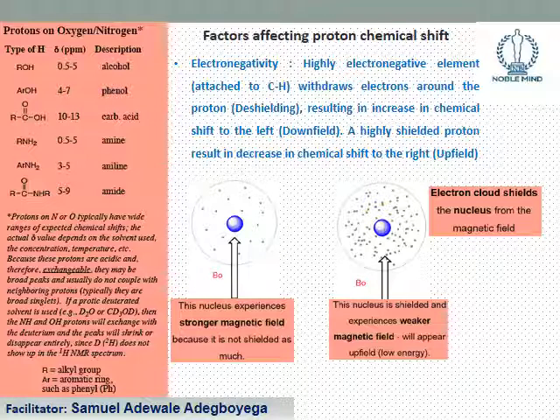So the table continues there, but let's talk about the factors affecting proton chemical shift.